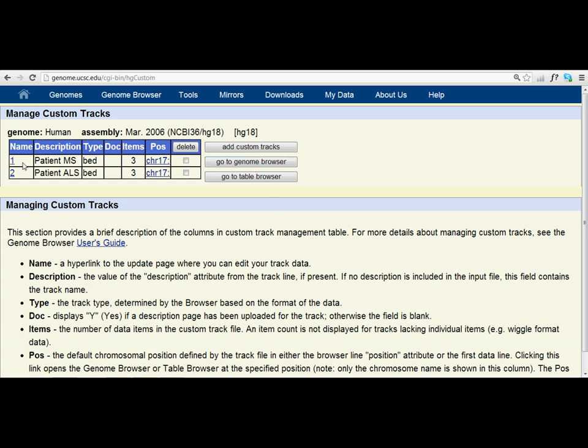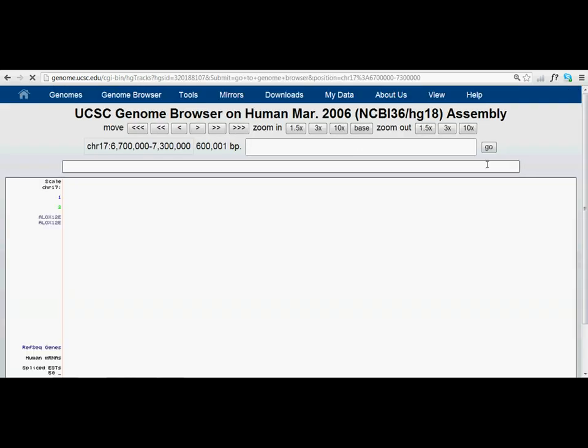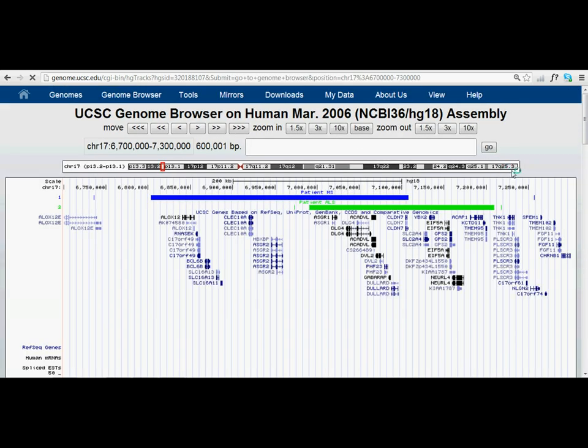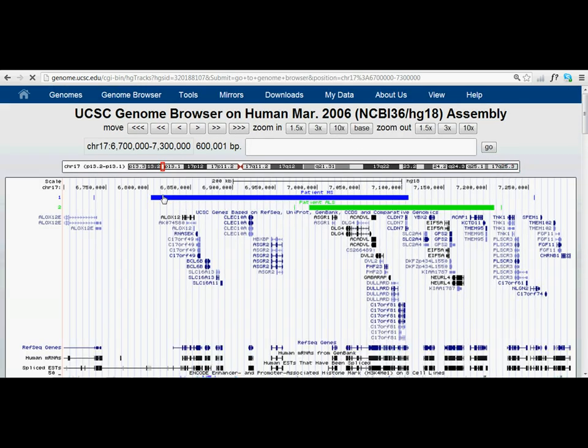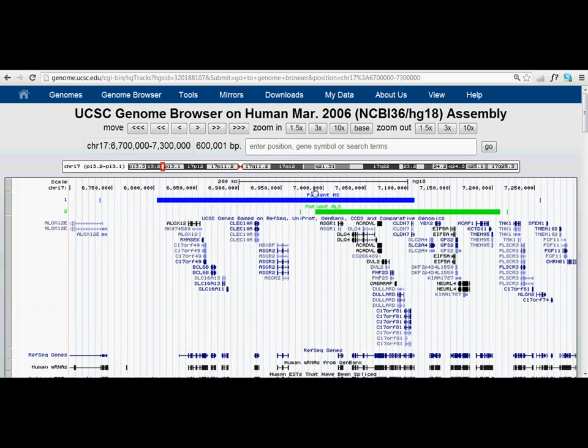So you see how we've got track 1 and track 2. And now we can have a look at our two deletions in comparison. Notice how patient MS here is logged in blue, and patient ALS is logged from here, green to green. So that's it. Simple. Thank you.